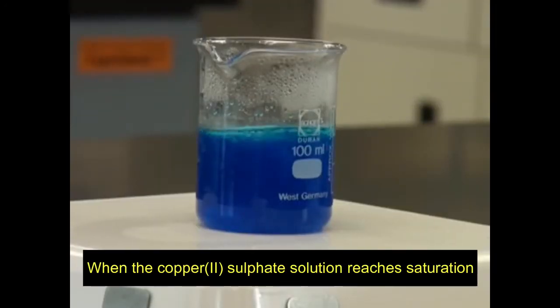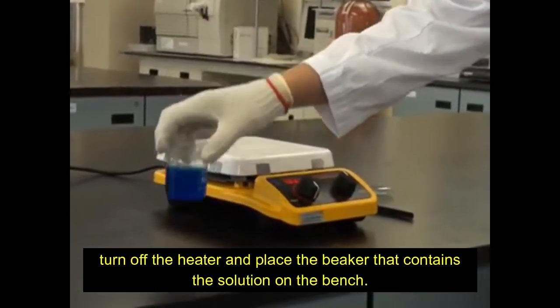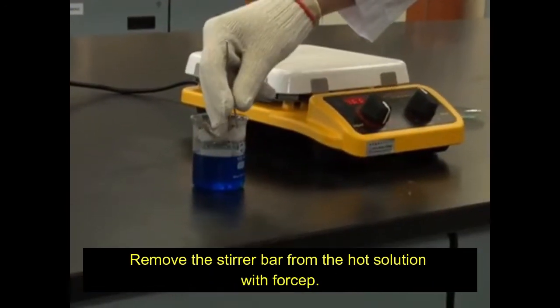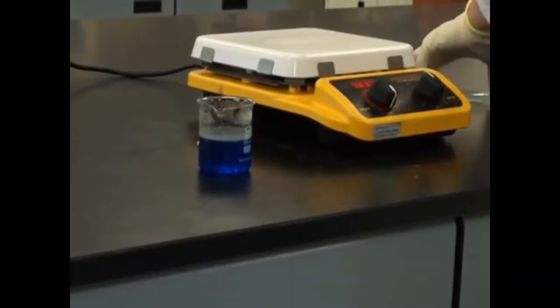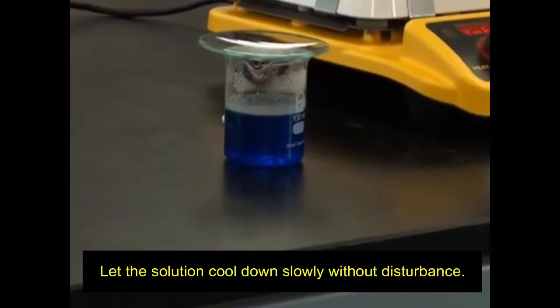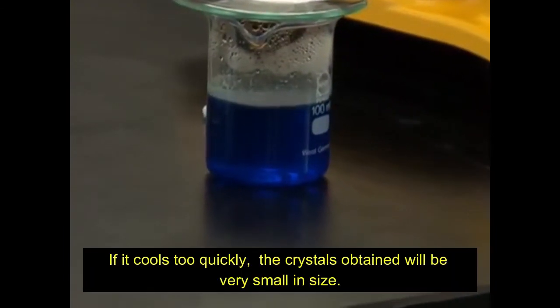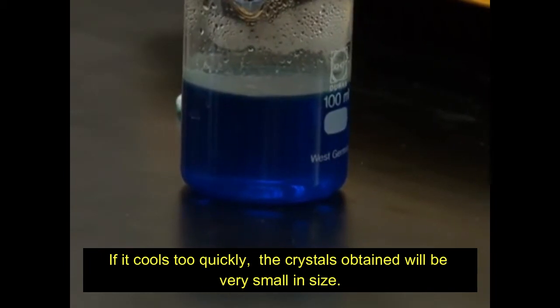When the copper 2 sulfate solution reaches saturation, turn off the heater and place the beaker that contains the solution on the bench. Remove the stirrer bar from the hot solution with forceps. Cover the beaker with a clean watch glass. Let the solution cool down slowly without disturbance. If it cools too quickly, the crystals obtained will be very small in size.